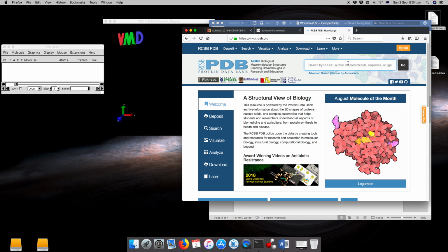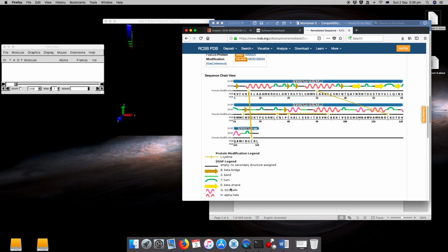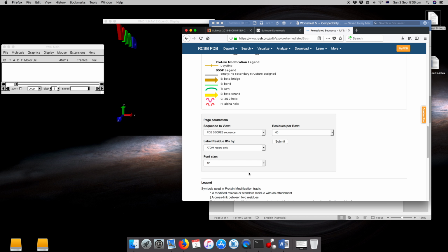So it's chain A, for example. Most molecules will have more than one chain that correspond to a particular complex or sequence. So you can see there's more information in here. We also have the sequence of the protein that was solved, of which you can get the FASTA sequence, length, polymer 1, etc. We also have a visual representation of what is what, beta strand, alpha helix.